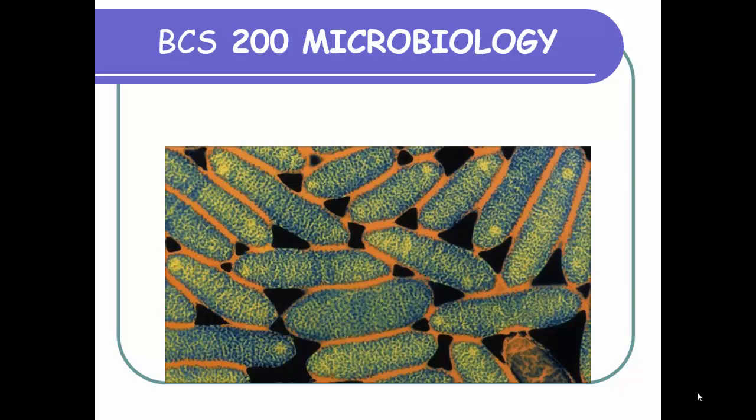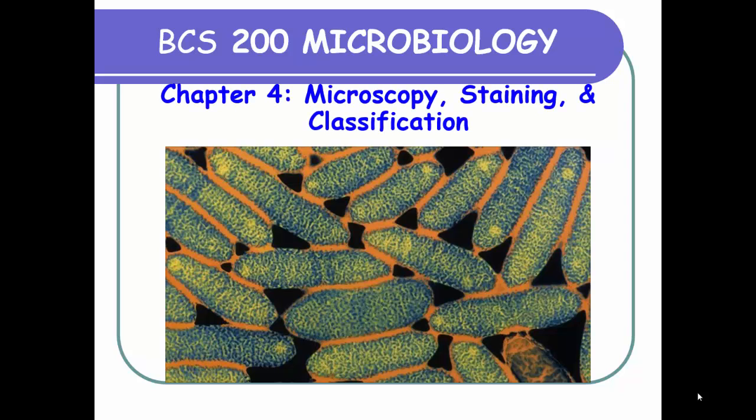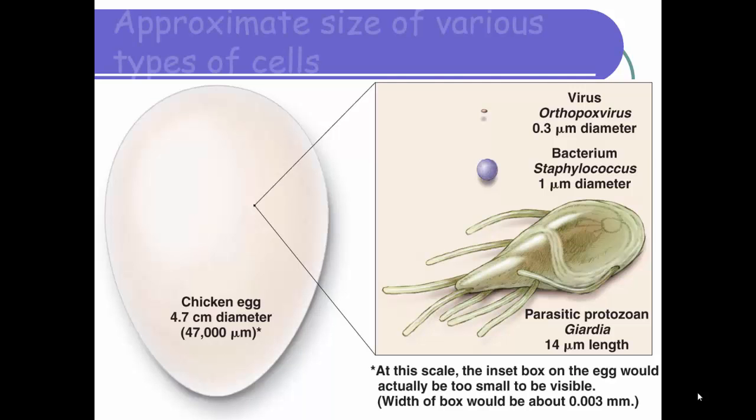Good morning. In Chapter 4, we will actually look at microscopy, staining, and classification techniques that we will use during this semester. This particular picture shows Legionella pneumophila, one of the bacteria we will look at, under the microscope using one of our techniques we'll talk about later on.